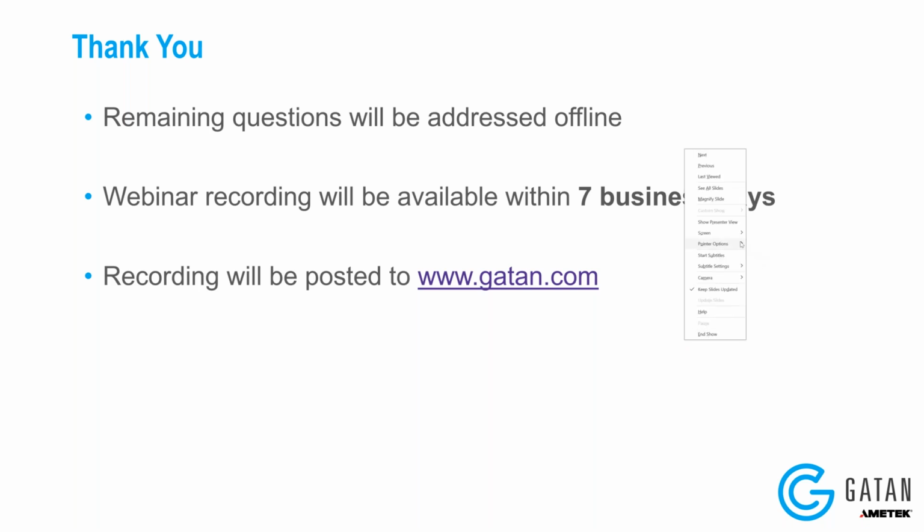Thank you, Fernando. We have a few questions that have come in. So the first one is, what type of scintillators are you using for these experiments? Good question. So the scintillator we use is an organic phosphor material. I think any more detail than that is proprietary, unfortunately. But there are a lot of different materials you can use and processes you can do to change the properties, like the thickness of the scintillator, etc. The one that we use in the ClearView is similar to the one that we used with the OneView.